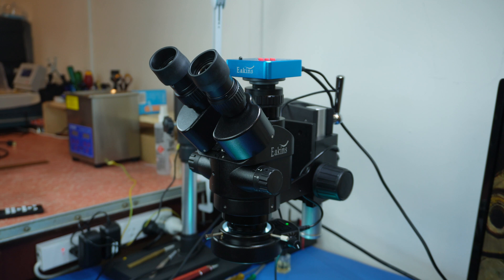I've been wanting a microscope for a while. I've been looking at the Amscope ones and I ended up buying this one from Eakins. I read a few things on the net that seem to suggest they both come out of the same factory. I can't verify whether that's actually the case without buying the Amscope one and doing an A-B comparison. Obviously I'm not going to do that, but this is the one I ended up getting from AliExpress.